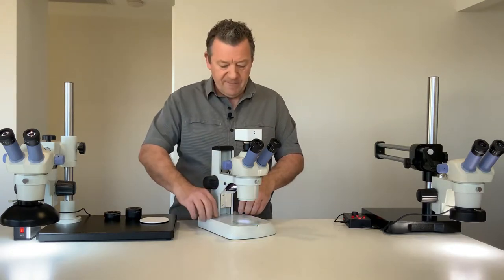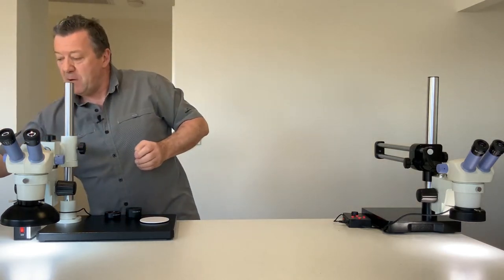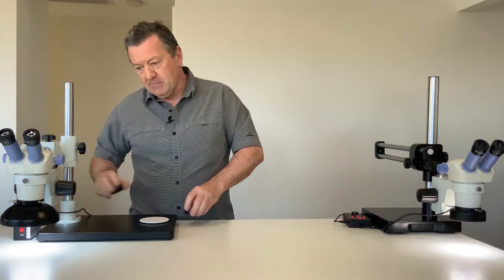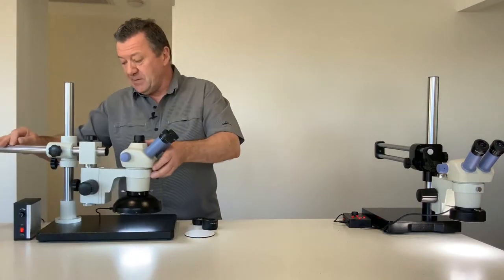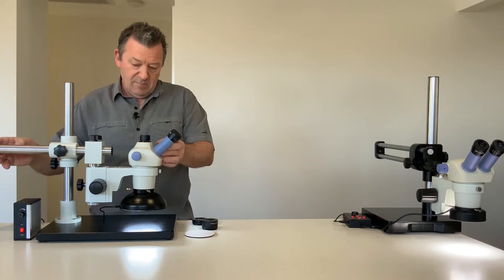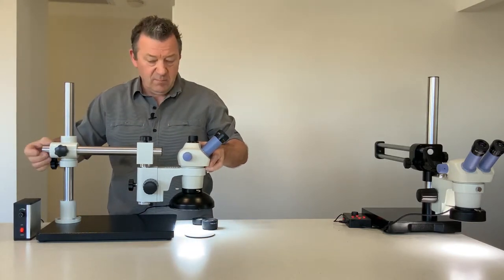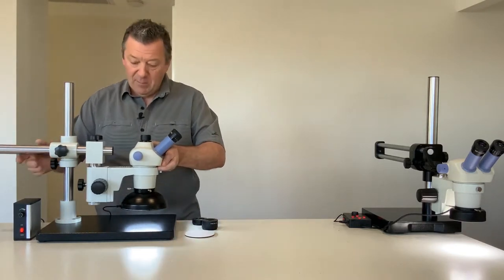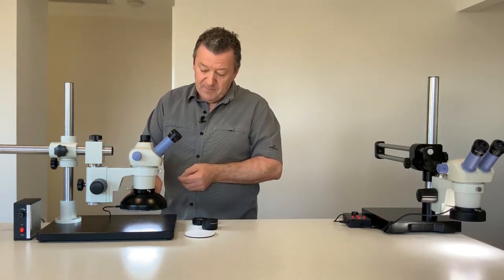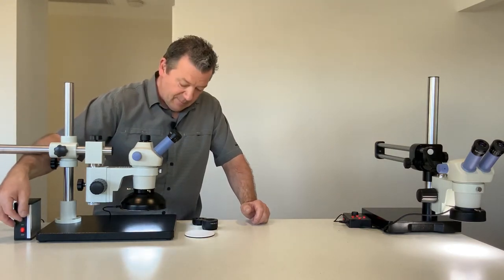We also have stereo zoom boom stands. This is the smaller of our boom stands, often used in the electronics industry for looking at PCBs, again available in trinocular or binocular configuration. These are adjustable, and on this particular model we've put our new dome illuminator, which offers superior illumination and comes with a variable power source.